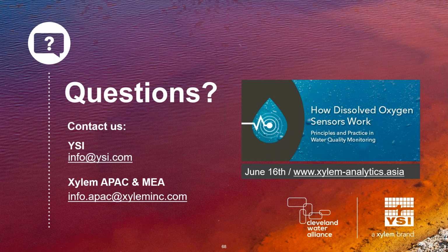So if it sees that you're at 0 millivolts when you put it into a buffer, it will not only correct for temperature, it will also say, okay, this is probably the 7 buffer that you just immersed me in. So yes, it will take care of the temperature. In our newer instruments especially, it'll take care of the buffer selection for you as well. Great, thanks. Okay, next question.